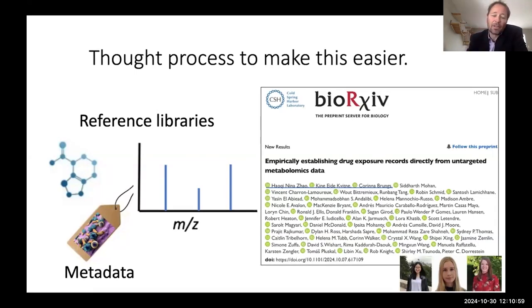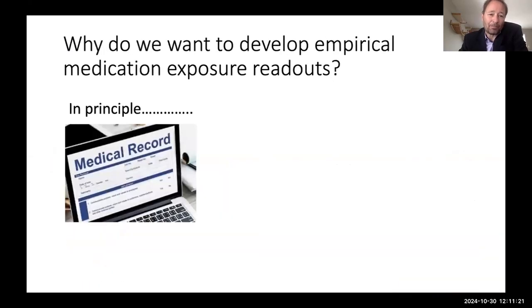And the idea was, largely, can we create a resource that allows you to quickly assess whether something is a drug or not? Or if you have a large cohort that you're studying, which samples that you studied actually contain different medications.